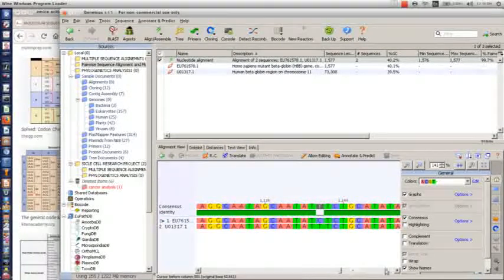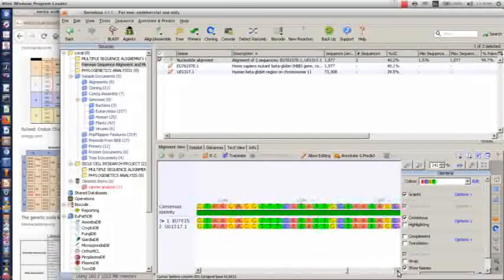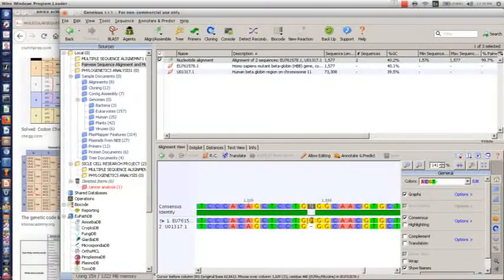Keep going. Aha. As you can see, this region is definitely different from all the mutation analysis of nucleotide bases that we have been working on from the beginning. Here we have G, and in the normal sequence we have a gap.